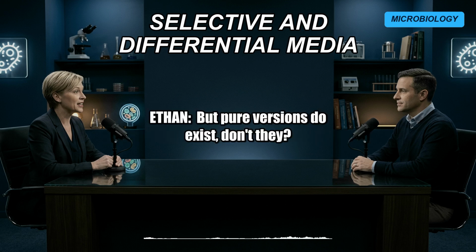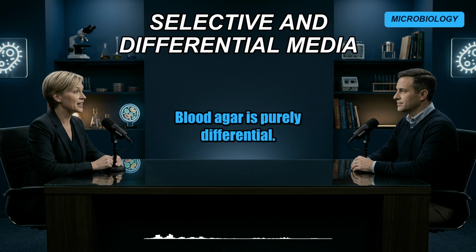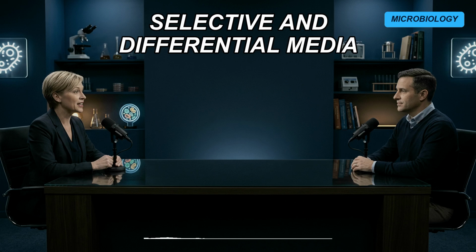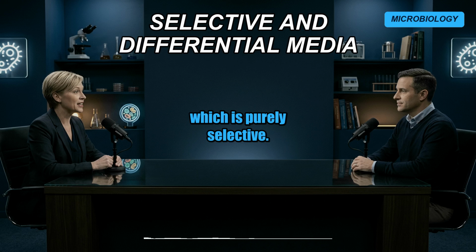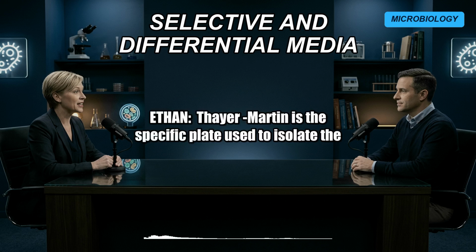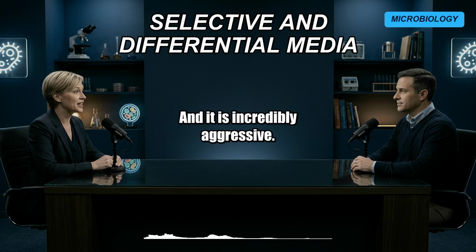But pure versions do exist, don't they? They do, and understanding the pure versions helps clarify the underlying mechanisms. Blood agar is purely differential. It lacks a bouncer entirely. On the other end of the spectrum, you have Thayer-Martin agar, which is purely selective. Right, Thayer-Martin is the specific plate used to isolate the bacteria that causes gonorrhea, and it is incredibly aggressive.